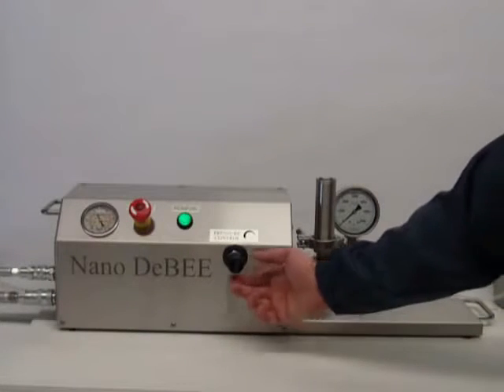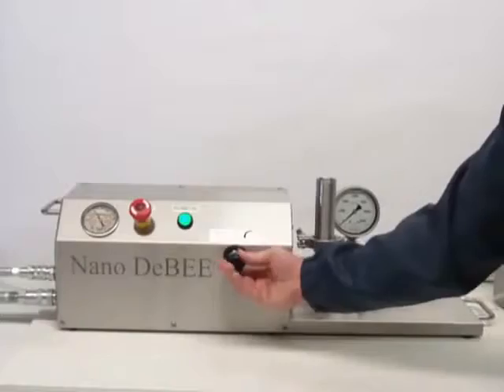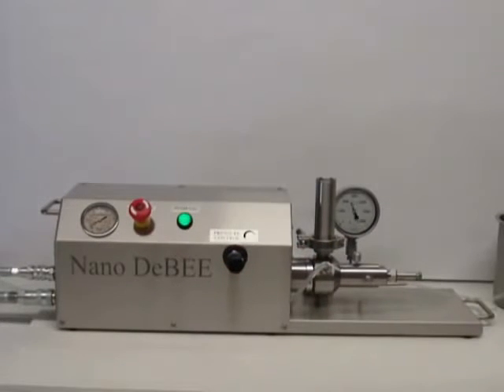We can increase the pressure up to 45,000 psi by turning the pressure control on. Products can either be collected or recirculated.